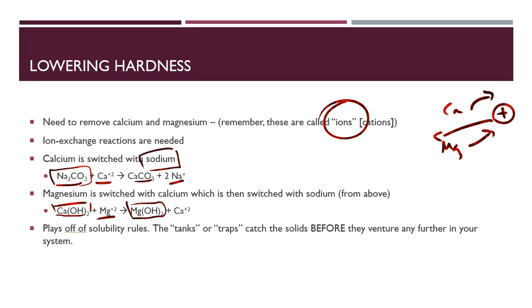They have a grand old night together. Who knows what they do? We never see them again. And then poor little calcium is left over in the bar and drowning away in its tears. Well, that calcium contributes to water hardness, but that's okay, because this calcium can react with the sodium carbonate that's already in the system, and now calcium gets revenge, because it just broke up with the hydroxide, and somebody else came in and took the hydroxide away from him.